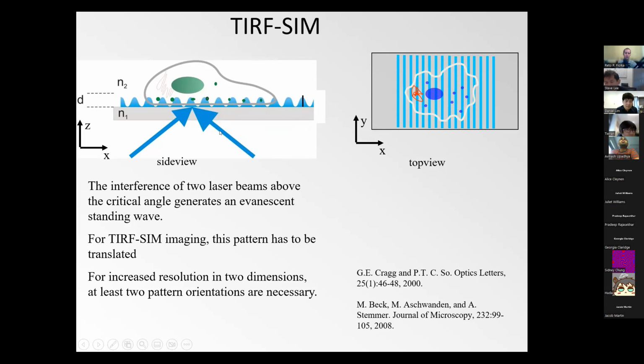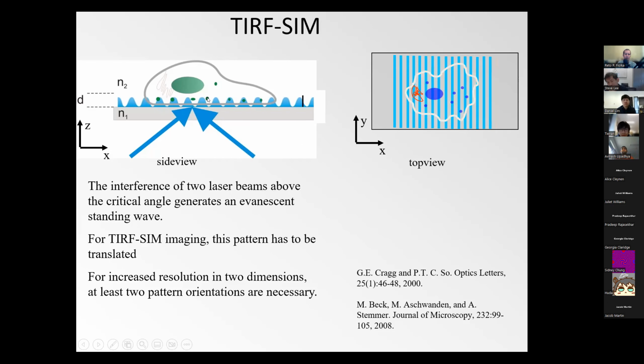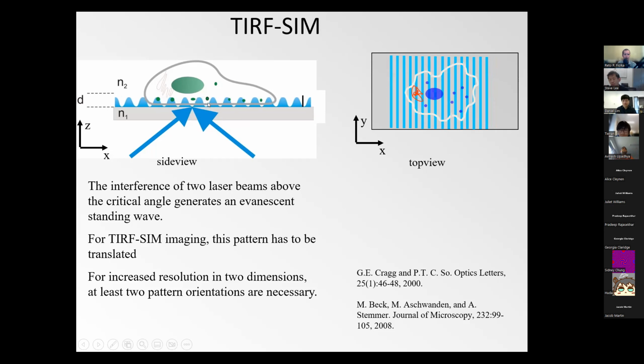And so what you need to do in a SIM microscope is you need to be able to phase step the pattern. This is a mathematical necessity, as I said, because we want to try to separate the information bands. The number of information components you want to separate dictates how many images you have to acquire. Without the mathematical rationale, we can also see that if there was just by bad chance a fluorophore in a minimum, it will not get excited for this pattern position. So by moving the pattern, we can make sure that every fluorophore that is in the sample has been excited.